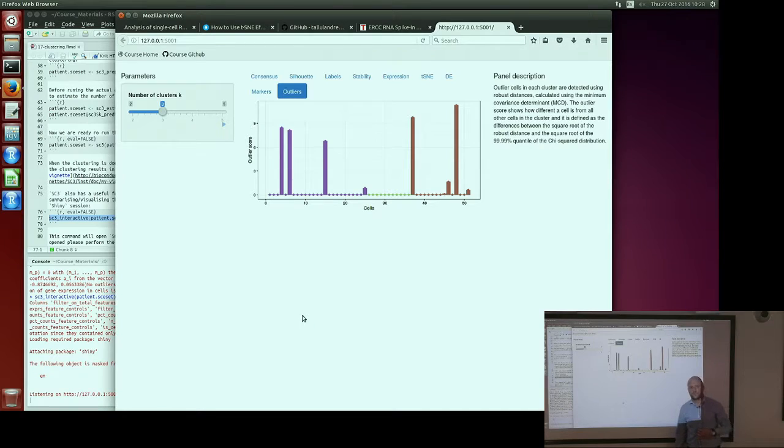Would you remove those outliers from your analysis? If you look at the last graphic, the two cells that go to the markers, I'm guessing they have very high total feature count. This is different. So the question is, would we remove outliers from the further analysis? In this case, I wouldn't, because I looked at the expression and it doesn't look very different.